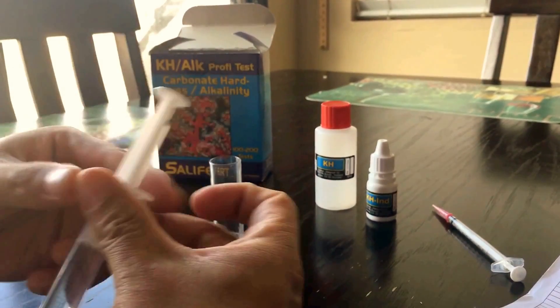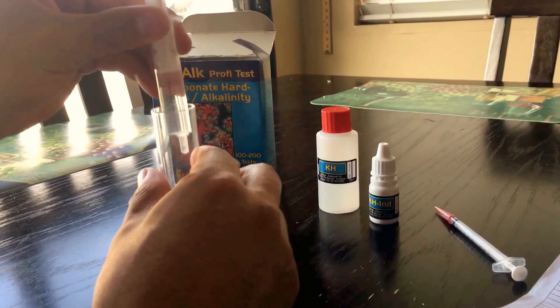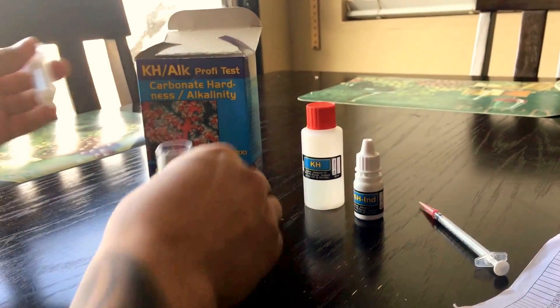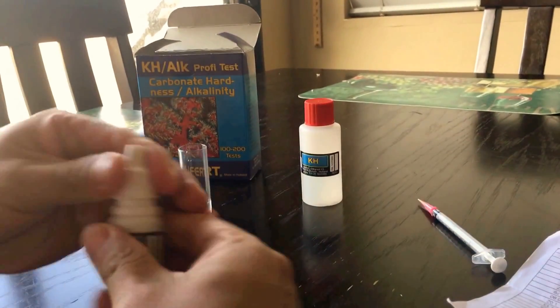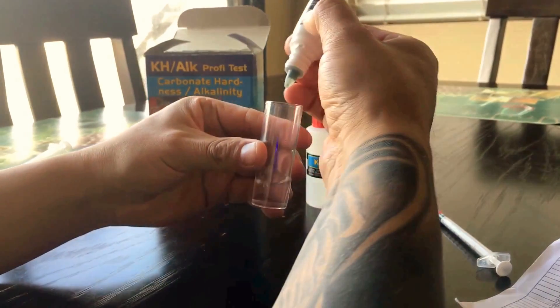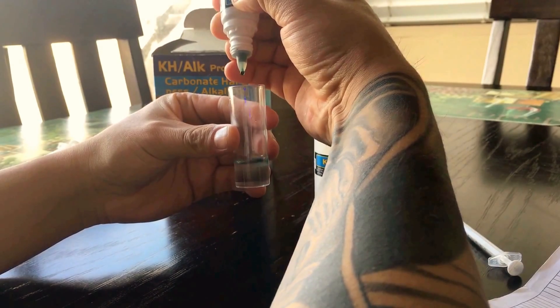So what you gotta do is get the syringe and draw four milliliters of your tank water. Shake this a little bit and then add four drops — one, two, three, four.